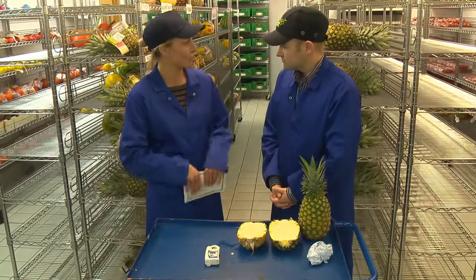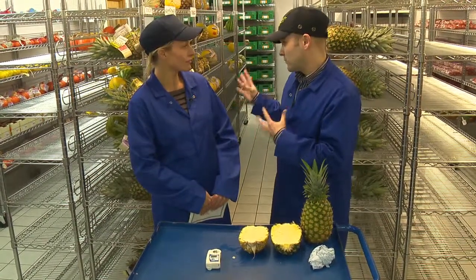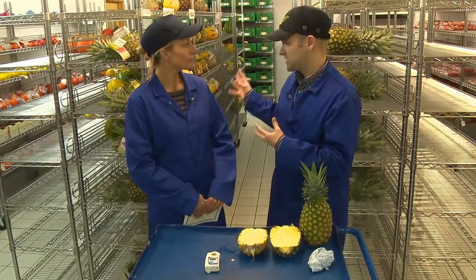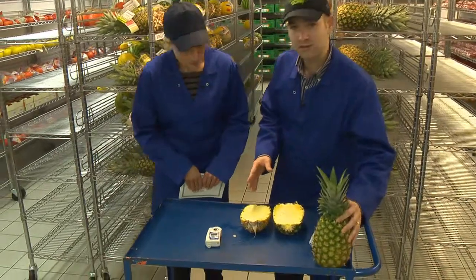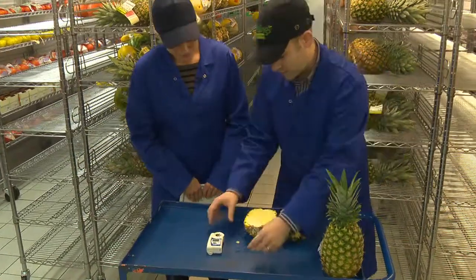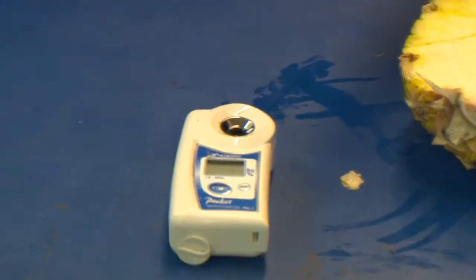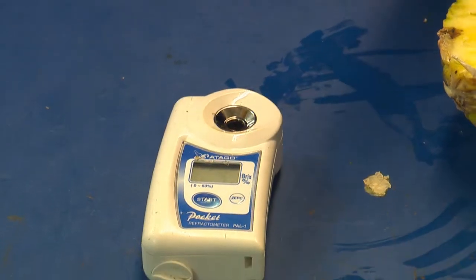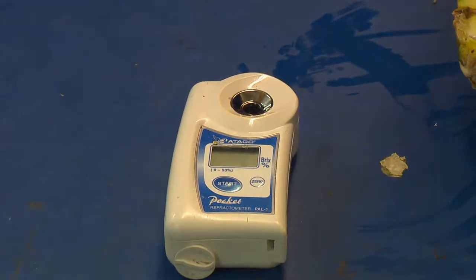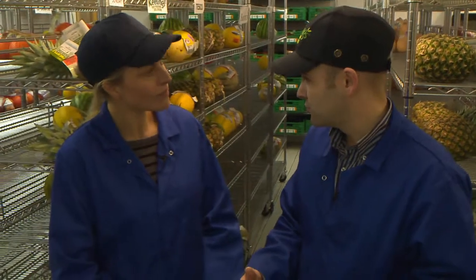So how often would you test the pineapples? Every delivery that we send, we take a sample. What I also wanted to show you is this is where we test the sugars. We use this device called a refractometer. There are two types of refractometer — there's one which looks a little bit like a telescope which you look down, and this is a more modern one with a digital display, and it's very simple to use.